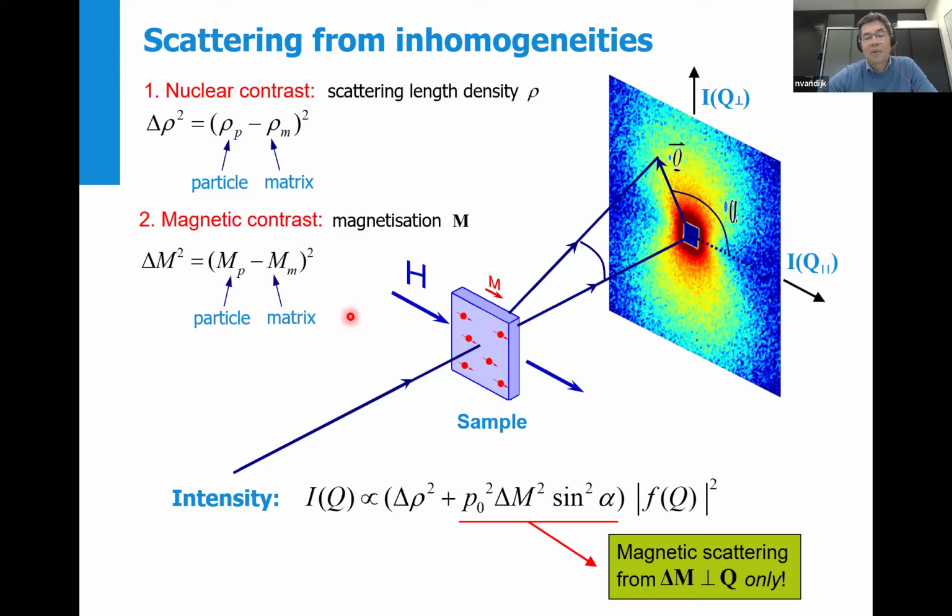So if you completely magnetize your material, so that all the spins are aligned, you will see that the scattering pattern actually has this funny 8 shape. That is because the magnetic scattering only occurs when there is a component of the scattering vector that is perpendicular with respect to the spins. So if the scattering takes place in this plane where Q is along the magnetic moment, then you don't see any magnetic scattering, and perpendicular you have the strongest scattering. So this is actually a way to separate the two contributions and make it possible to analyze what you measure.